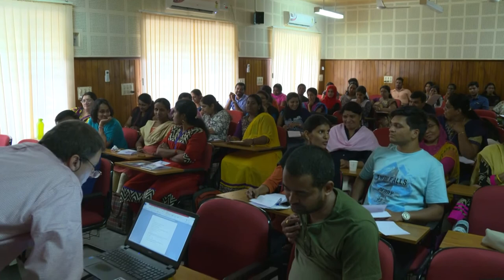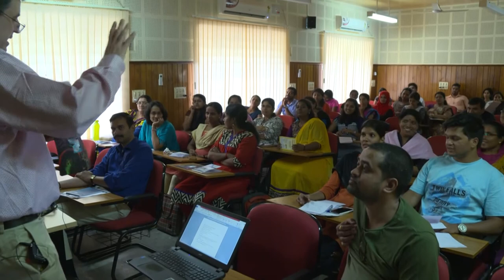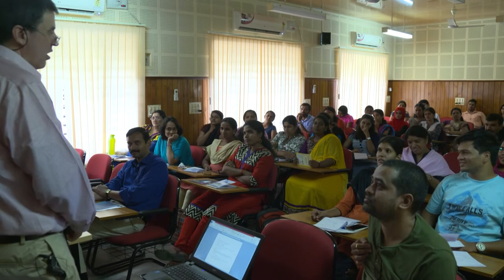Okay, true or false? You got to raise your hand, though. It's an easy one. If an antibody works on a Western, it will work on immunofluorescence every time. True or false? False.